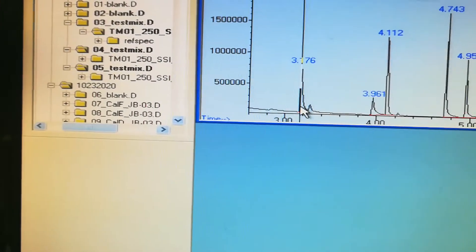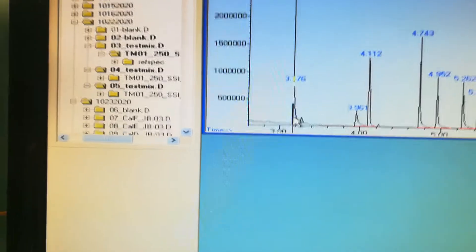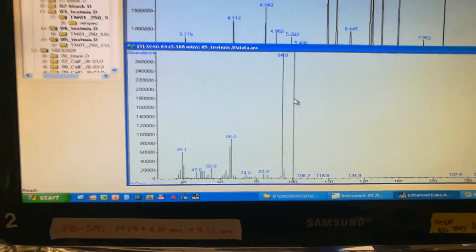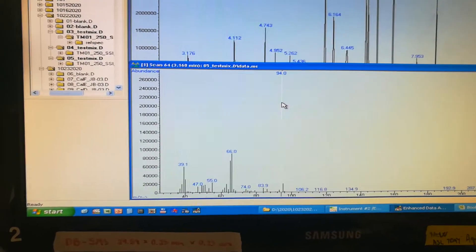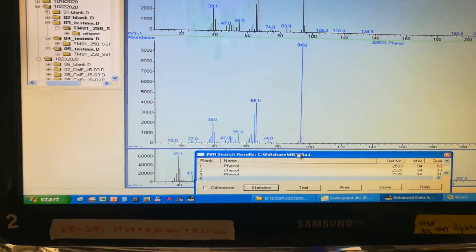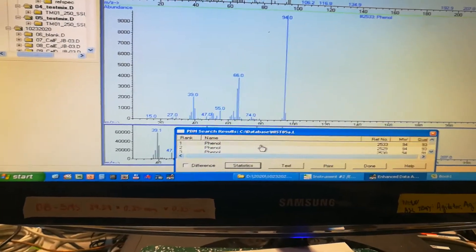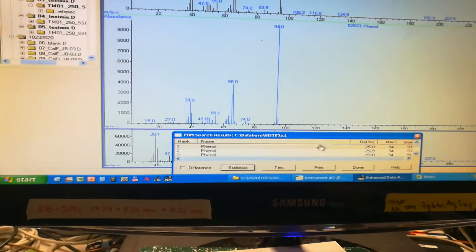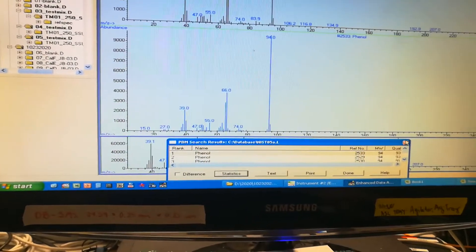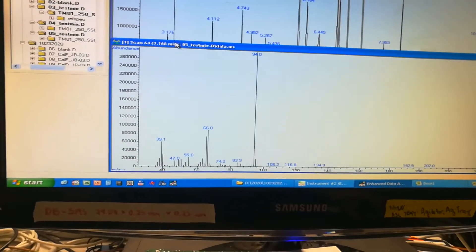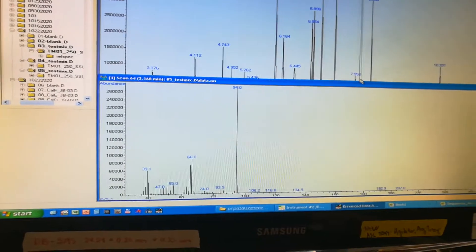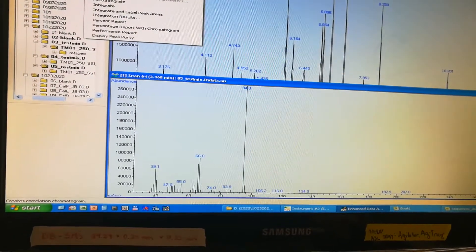The first peak here is the 3.176 peak where we can just double right-click to get the window that has the peak fragments. We have a base peak of 94, and if you double right-click on that base peak we can see what compound matches with that peak or ion in the library. Right here it's phenol — that's the compound. So the first peak, the one with the 3.176 retention time, is phenol.